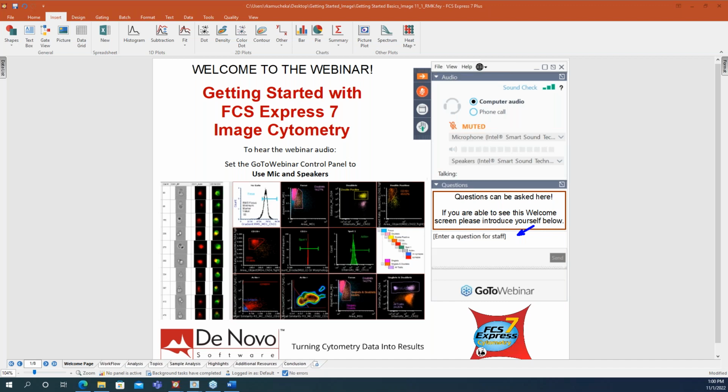I want to make sure that the information I'm providing today is helpful for you and gives you the tools that you need to start doing your analysis in FCS Express. So I really want you to get the most out of your use of FCS Express.